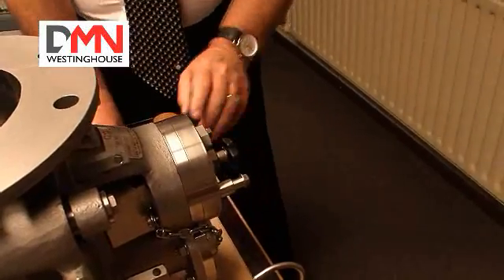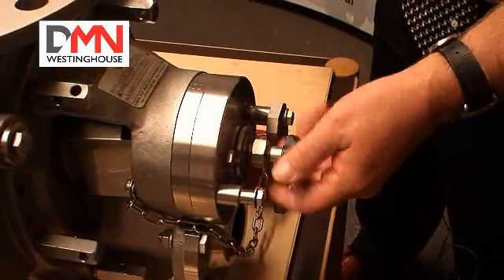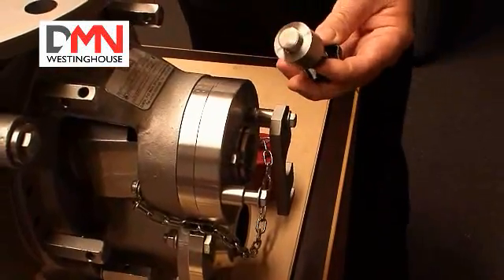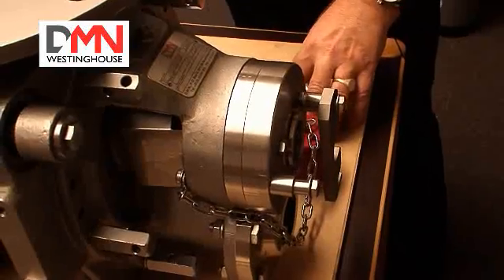Remove the locking nut from the valve. The function of this locking nut is to make sure that the rotor has two fixed points when in operation. What it does is override the Belleville washers that are mounted in this assembly here.